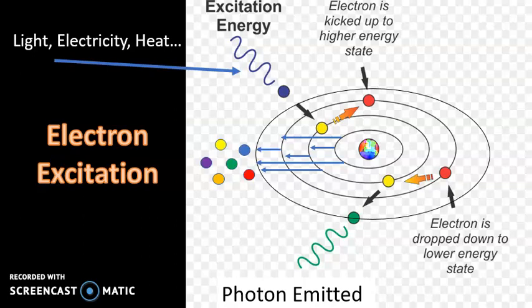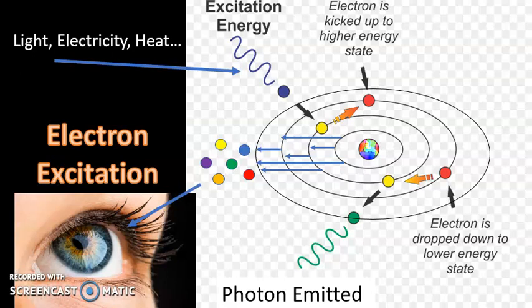Now what's weird is when we go to flame test, we only see one color, because as these different colors of photons hit our eye, it is so sophisticated that it doesn't want to confuse our poor little Neanderthal brains and merges all of those colors down to one color so that we can more easily and simply interpret the world. And unfortunately, that's really going to work not in our favor during the course of this experiment. We need to be able to see all of these different colors. So we're going to need an aid, an assistive device to try and get us through making these observations.